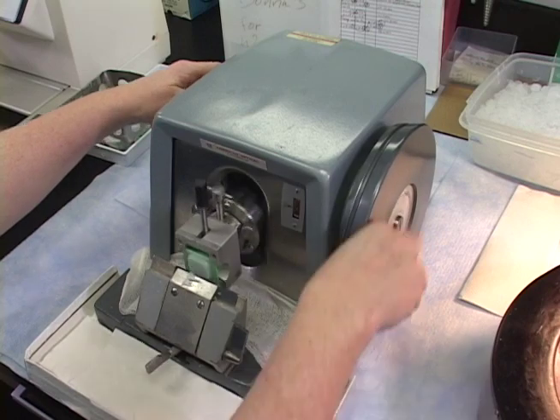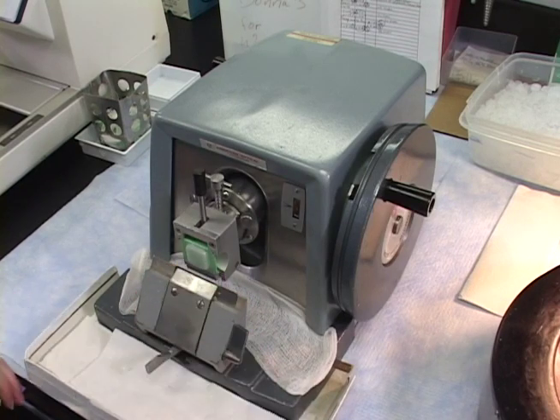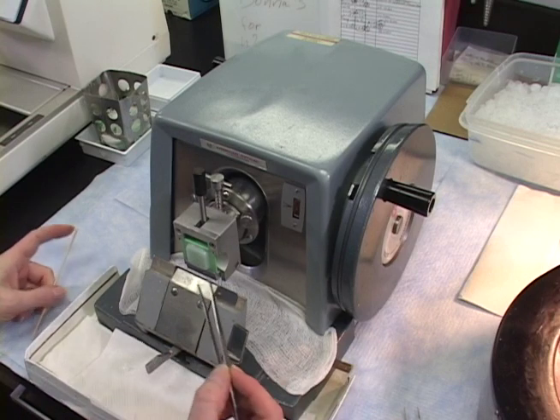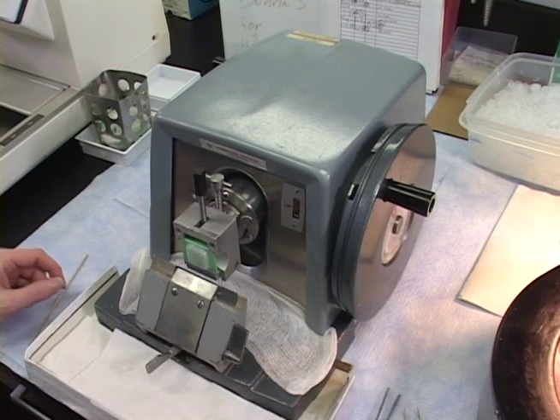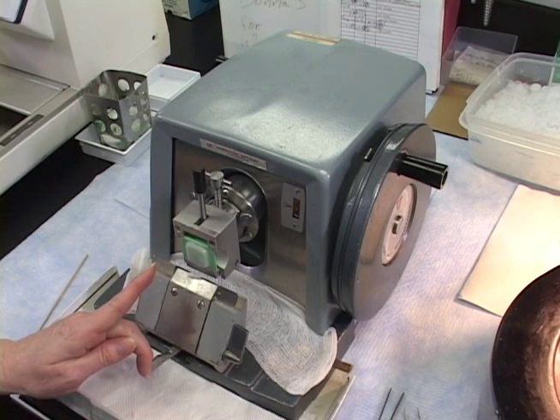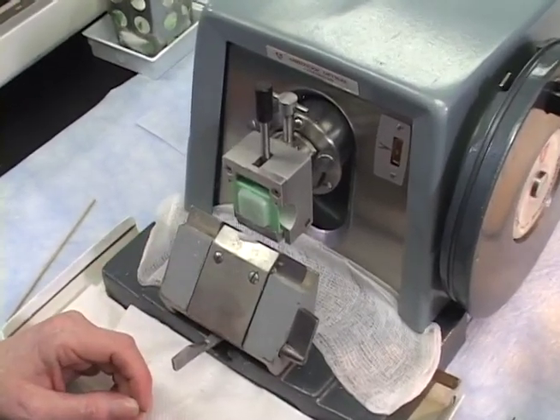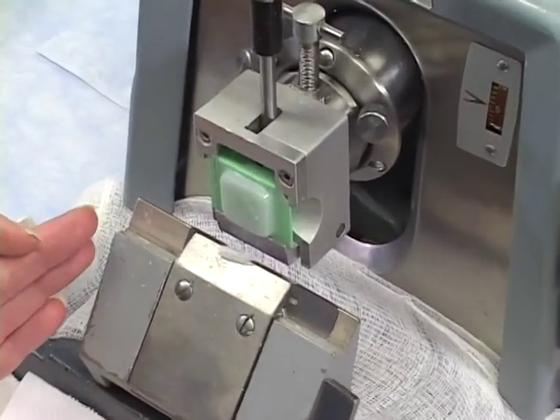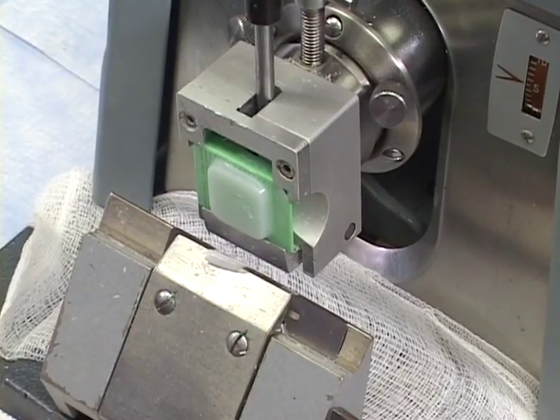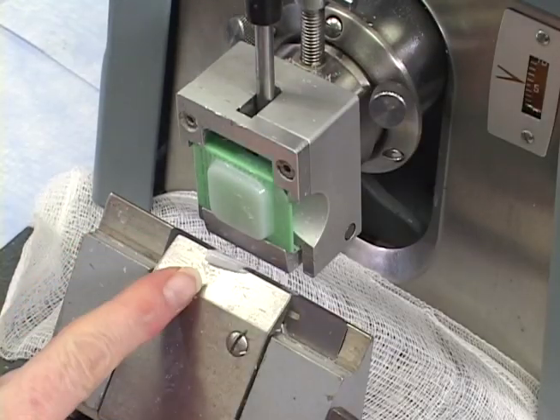Now you can see, you want to get the full face. Now see, if this were a patient sample block with the tissue in here, I would notice that this block that somebody gave me, I'm cutting on this left side first. And maybe I don't want to do that. I don't want to cut through precious tissue. I want to even up this block to match what somebody has done before. Now, that's where this slight knife adjustment comes in, though you don't want to do this too much. So I would lock the locking mechanism on the flywheel. And I see that it's cutting on the right side.